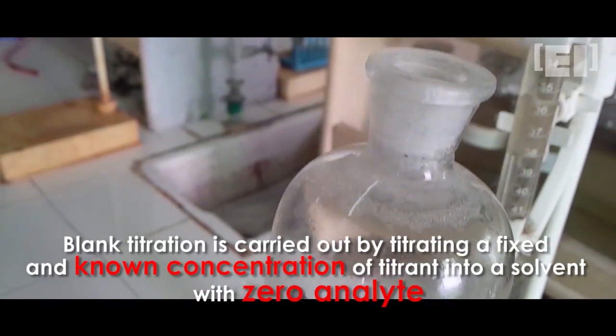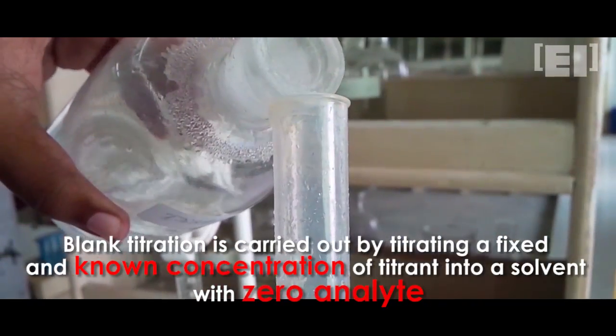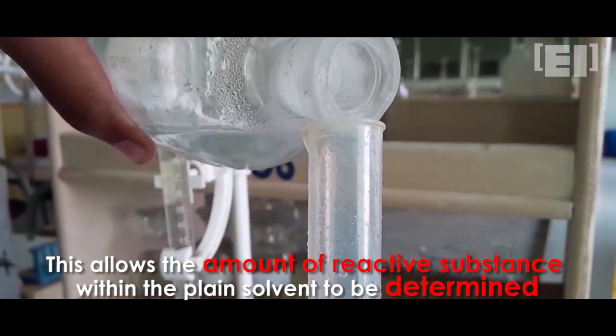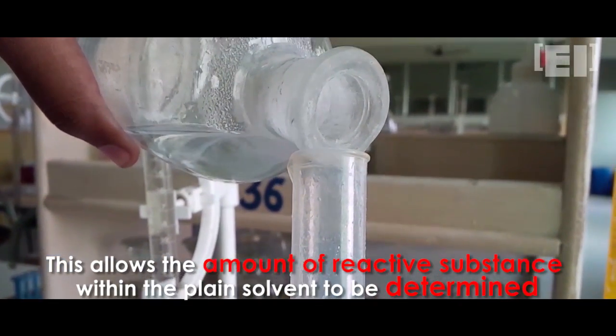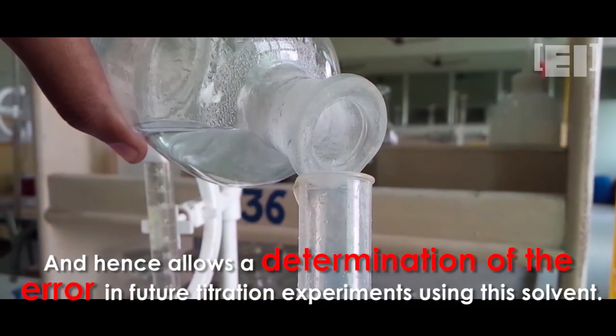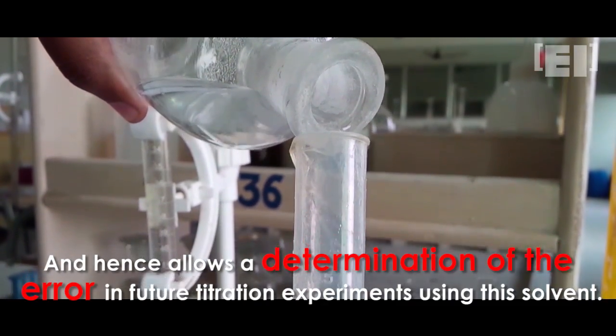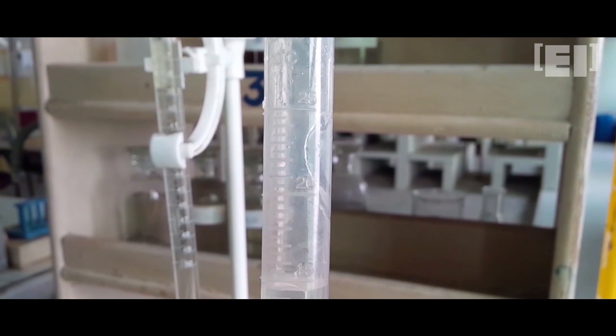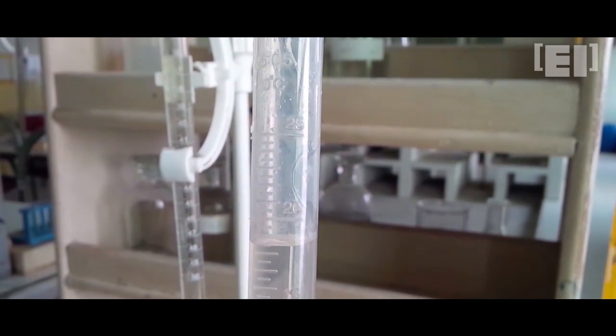A blank titration is that process in which the analyte is not present in the solution to be tested. It is done to check for possible sources of errors. For example, the water sample contains many impurities which can eat up the AgNO3 molecules. This may give you an inaccurate reading. So as to avoid this, we subtract the reading of blank titration from the general titration's reading. This minifies the chances of inaccurate readings.